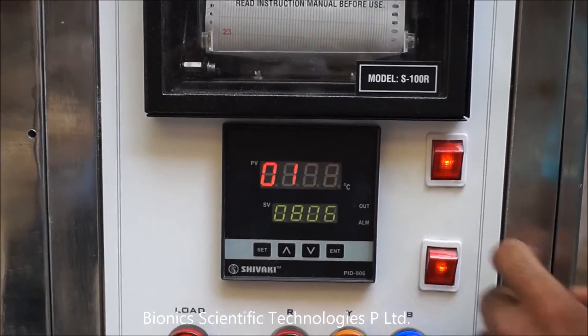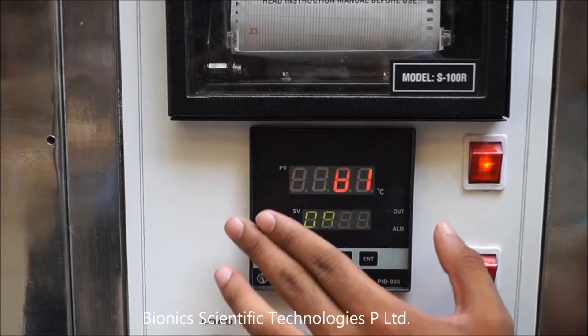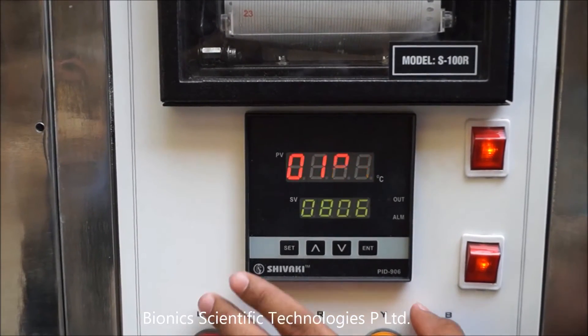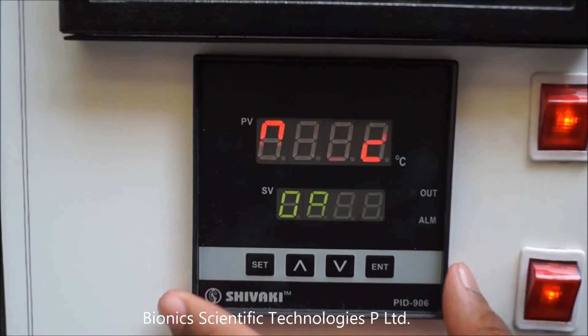This is the PID controller. With this PID controller, you can adjust the temperature according to your requirement. By pressing these buttons, you can adjust your temperature.